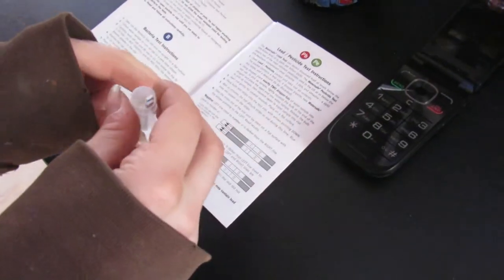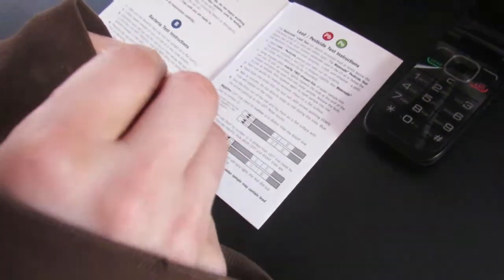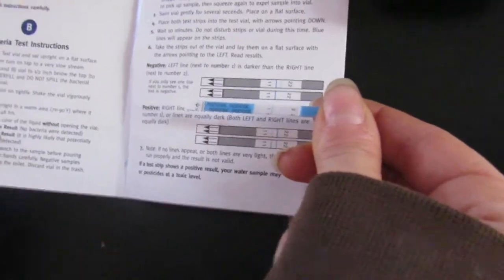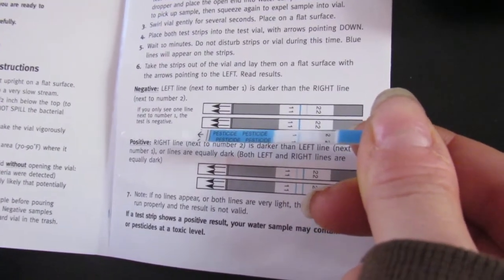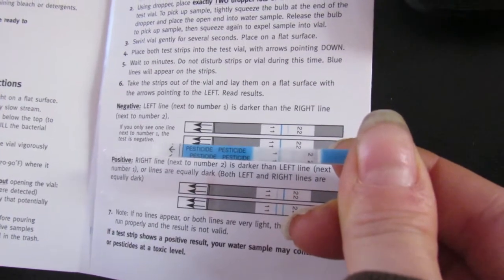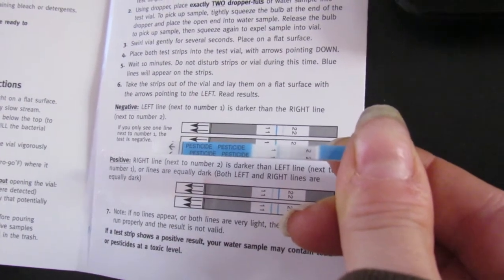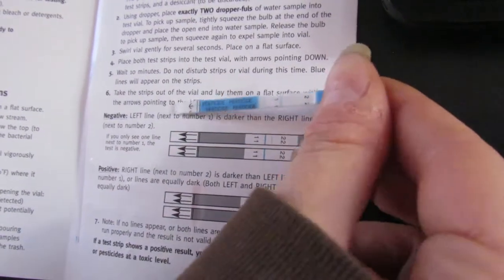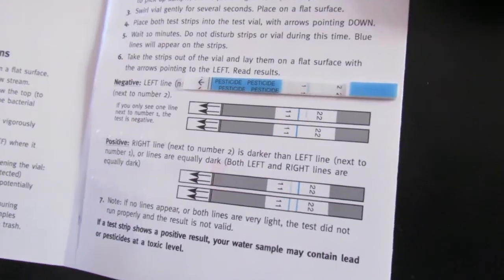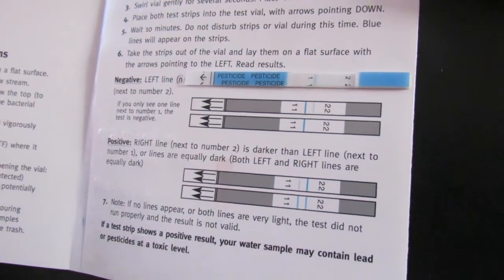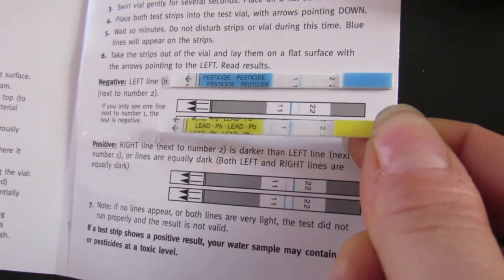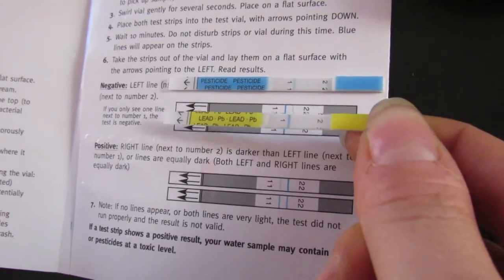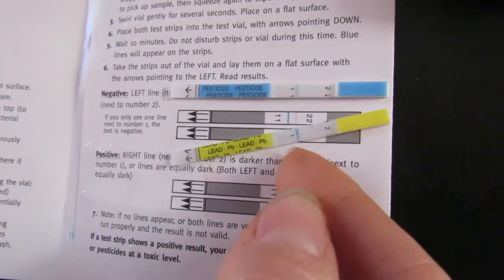The 10 minutes are up for the lead pesticide test. So let's check it out. You take them out. It says if the left line is darker than the right line that you have negative results. Here's our pesticide. Definitely darker on the left. You can see it on the right, but definitely darker on the left. So that would be a negative result. So that's good. We have a lot of golf courses around, so I was a little worried about the pesticides. And the lead. Yep. Darker on the left than on the right. So that's a negative again. So good results so far.